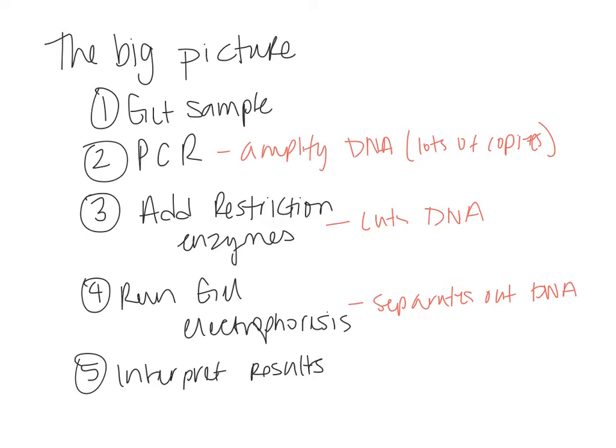Once we have just DNA, we run it through PCR. PCR is polymerase chain reaction. What that does is it amplifies the amount of DNA. Amplify means makes more. So we're going to go from probably thousands of copies of DNA to millions of copies of DNA. And it only takes about 40 minutes. We need lots and lots of copies. That way we have enough in order to see our results. So we get our sample, we run PCR.